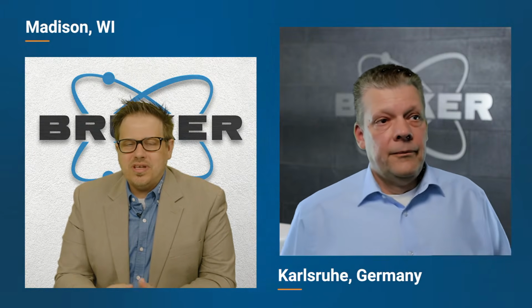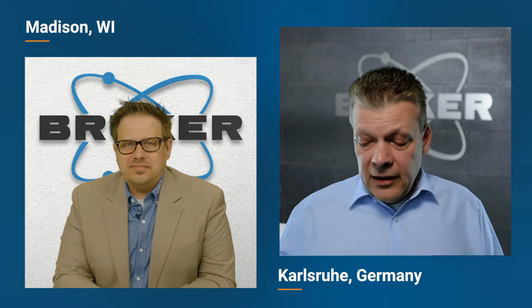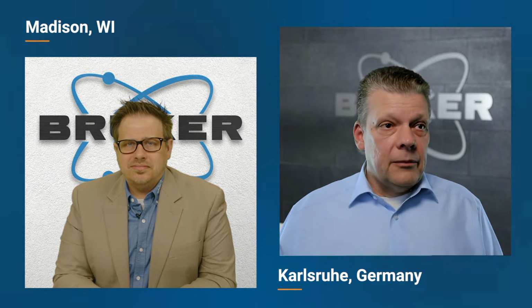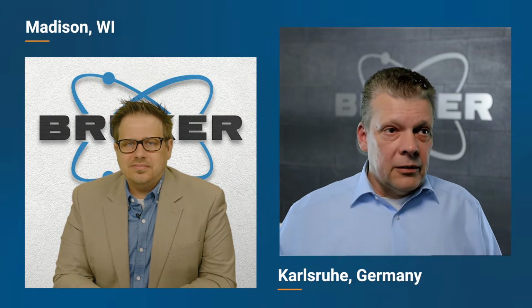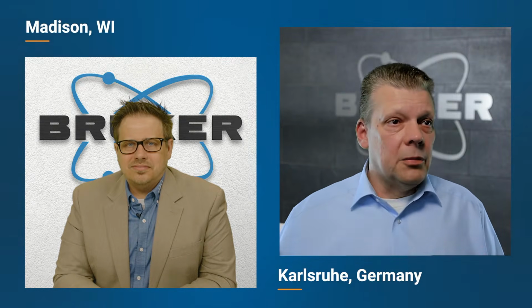So now the technique sounds fairly industrial in nature. Is that where we're seeing the majority of applications? Yeah, you're absolutely right. That is the vast majority of applications, industrial, also industrial research, because there are still some vendors that are creating new alloys and developing them, but more than 99%, I think, have an industrial background.